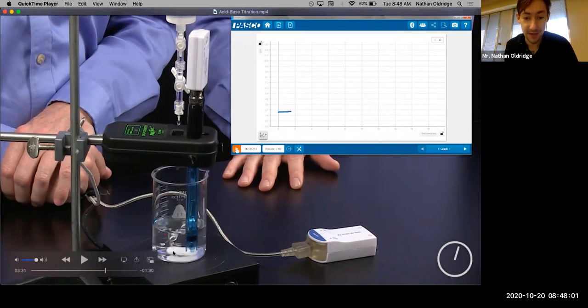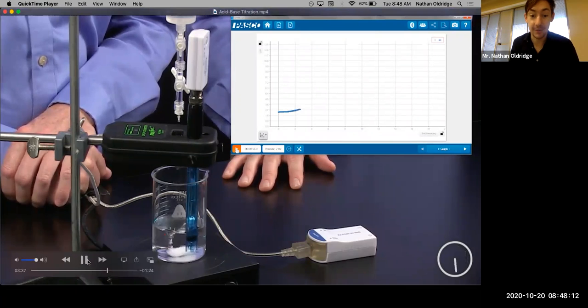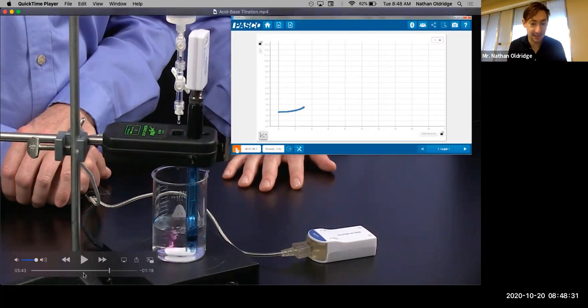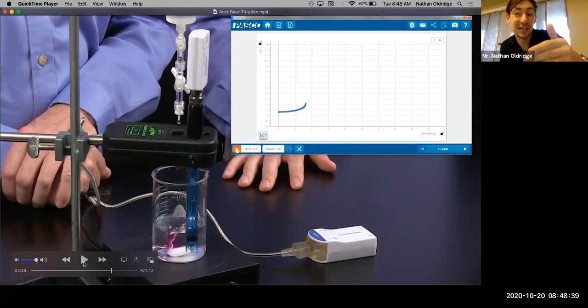So I want you to watch this as the drops get added and notice that it starts to turn pink. He's speeding it up time-wise. There we go. You can kind of start to see some pink appearing in that solution. Now, what's happening is the magnetic stir bar is mixing it up. That base that he added, which is hyper concentrated right there because that's where the drop went, gets mixed together. Overall, the solution's still acidic, so it stays clear. All right, drop, drop, drop. You can see it's starting to stay pink just a little bit longer.